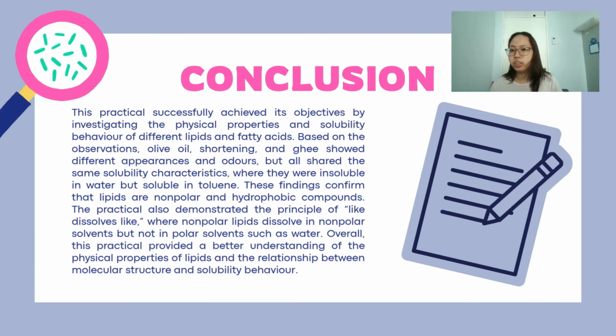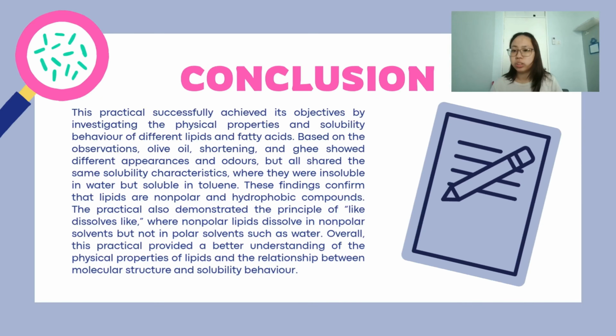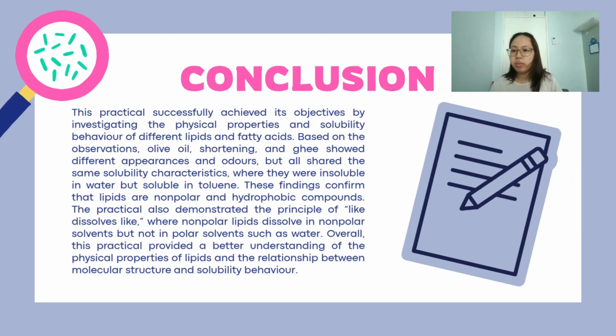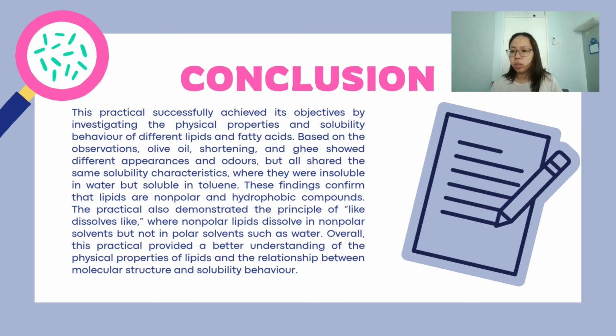In conclusion, this practical has successfully achieved its objective by investigating the physical properties and solubility behavior of different lipids and fatty acids. Based on the observation, olive oil, shortening, and ghee show different appearance and odor, but all share the same solubility characteristic, where they were insoluble in water but soluble in toluene. This finding confirmed that lipids are non-polar and hydrophobic compounds.